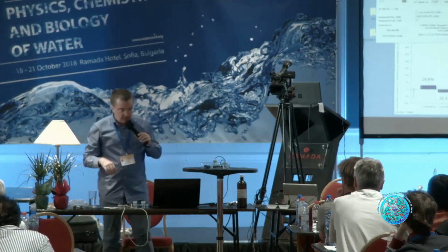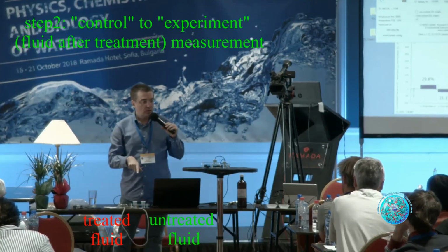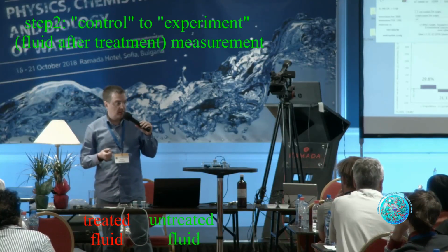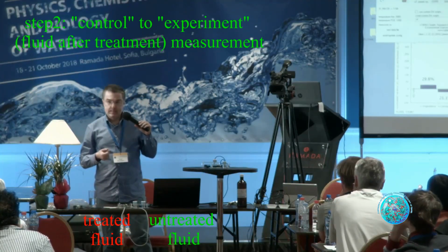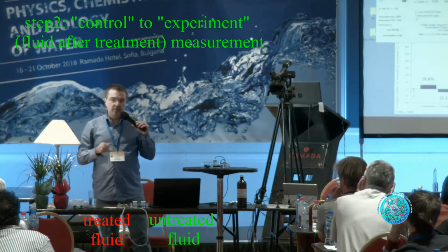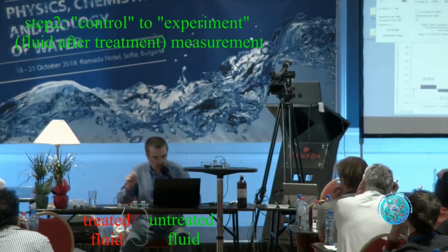At the moment channel 2 is untreated, it is a control, and channel 1 I now replace with treated water. Chemically, let's postpone this question until after this.